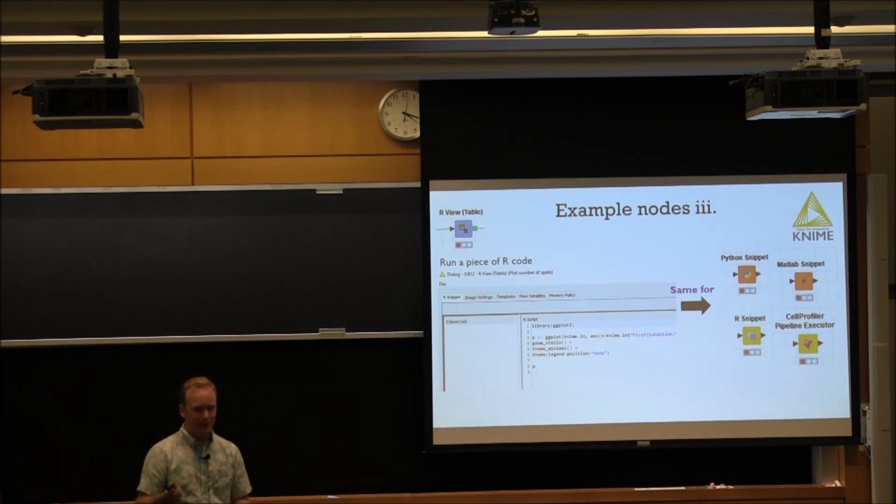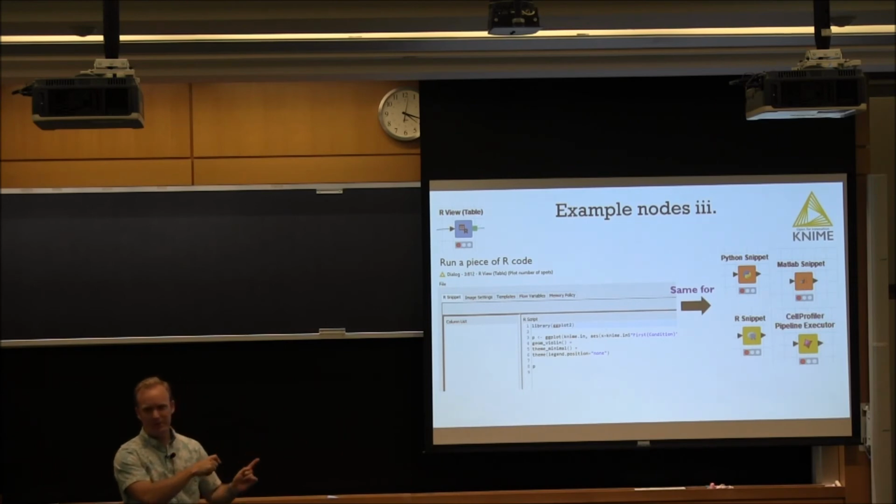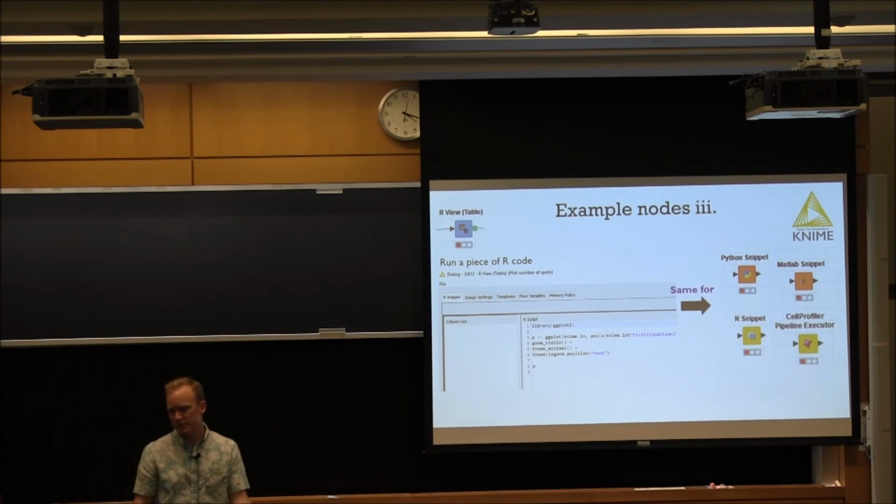So the beauty is that when you're using KNIME, it's just a way to organize yourself. You're just running the same stuff that you're running in Fiji, right? So if you want, you can fiddle around in Fiji until you get your processing right and then throw it into KNIME. It's going to be the same functions in the end. So whatever you're more comfortable with. For me, if I'm just quickly checking an image, I open it in Fiji. But of course, Fiji is going to give you repetitive strain injuries if you try and do a lot of other stuff. You can process the movie.